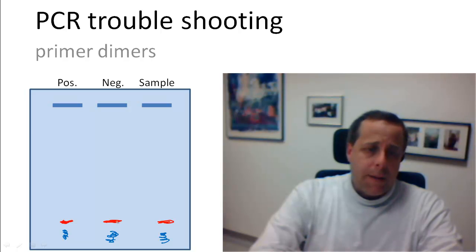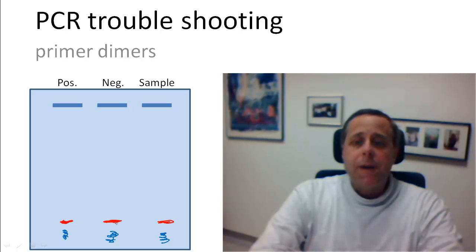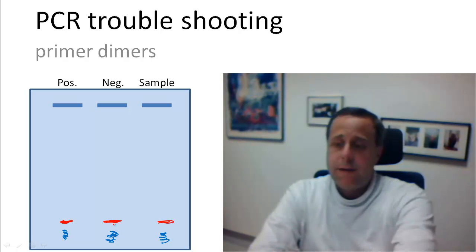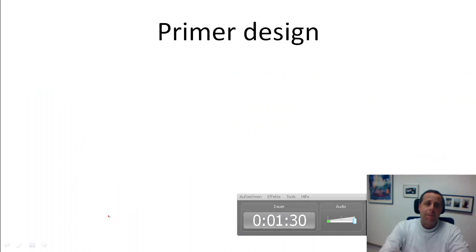That's the primer dimers that are forming as a result of primers that would be annealing to each other and that will compete with the amplification of the template DNA that you actually mean, and that's why you are having trouble. So let's have a look at what can happen.